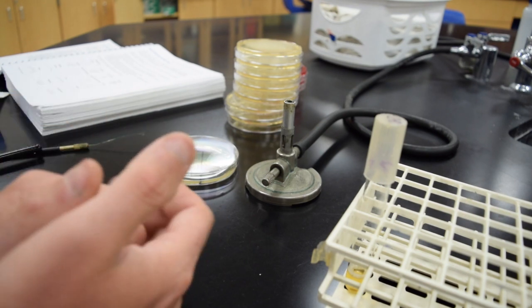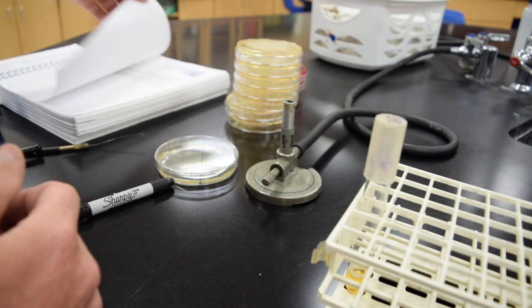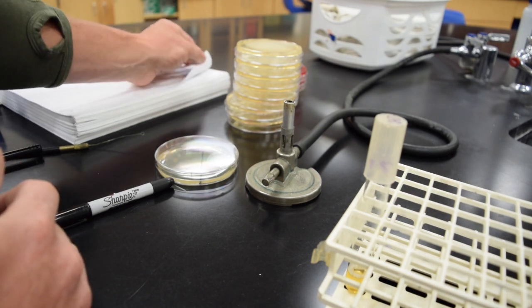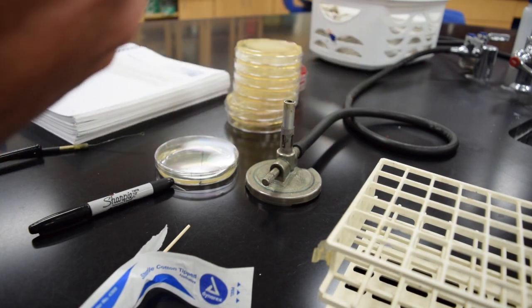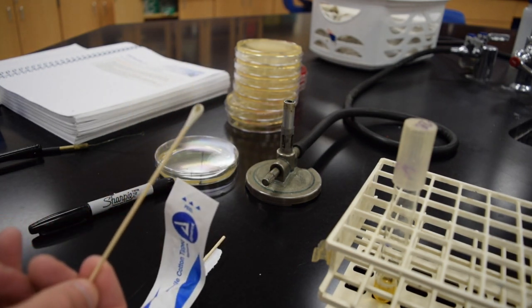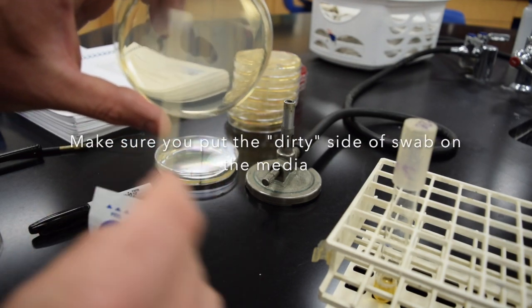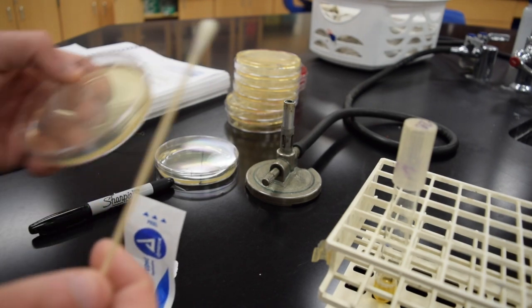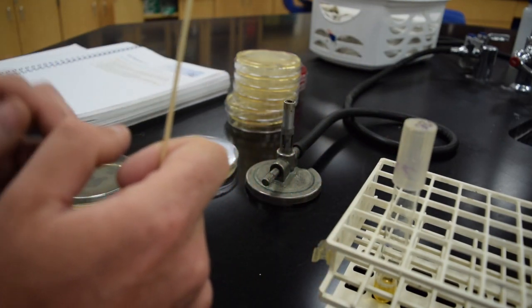Lab 1.2, which we will do as well, is an environmental sampling lab. For that you'll use a swab — dip the swab into your broth and swab a surface. I'm just going to quickly do the bottom of my shoe. You'll use a new TSA plate and simply swab that around on the media. When doing this, you want to be aseptic, meaning keep these plates covered when you're not using them. We will incubate those for 24 hours at 37 degrees and then analyze the results the second day.